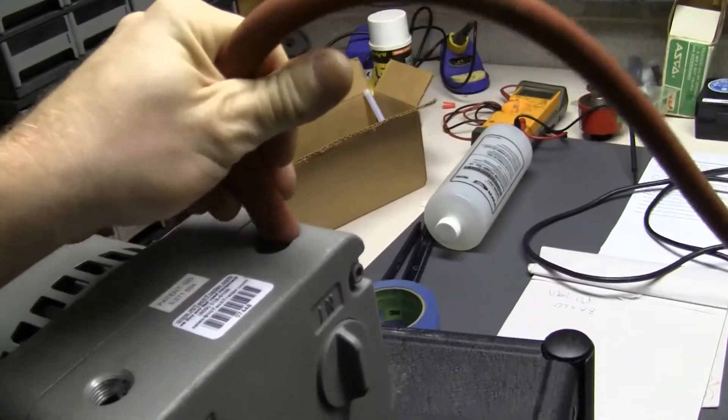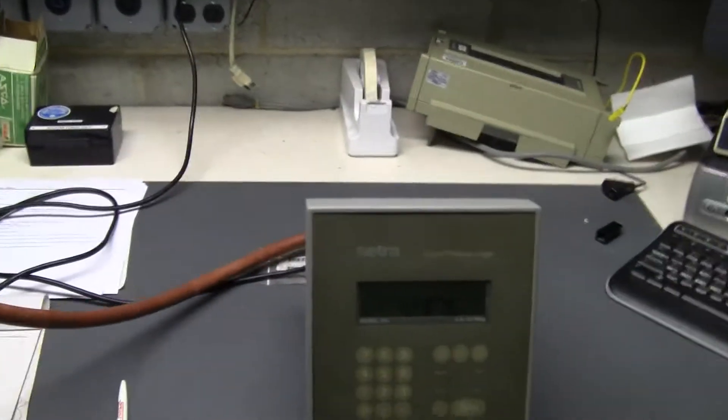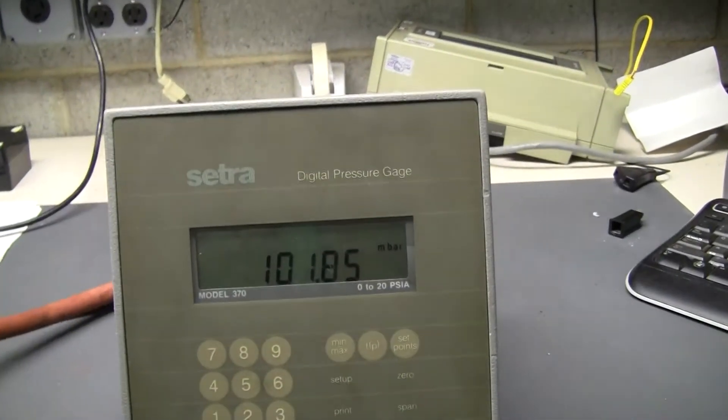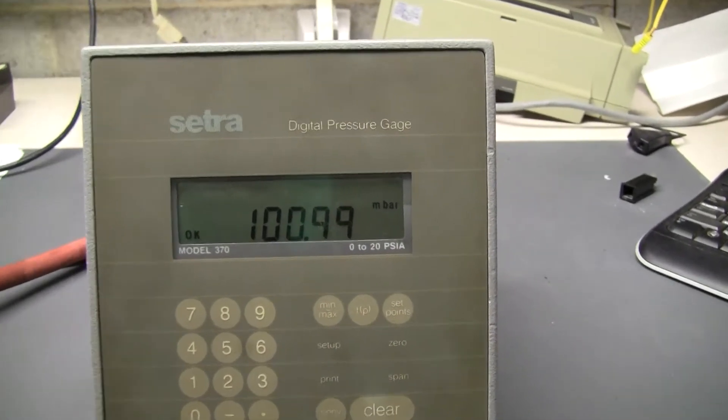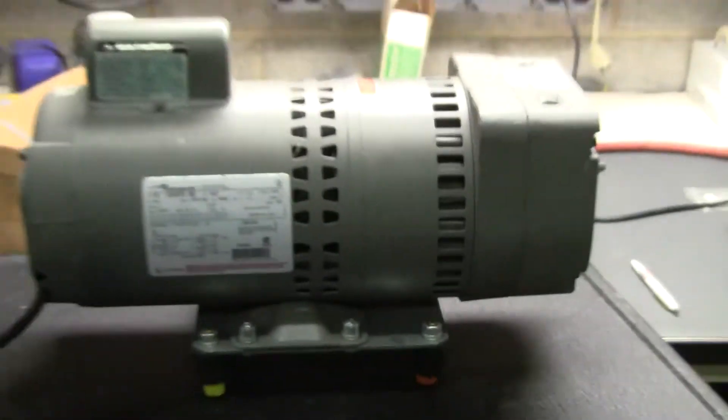Let's hook our vacuum gauge up. You can see it pulls down to 100 millibar.